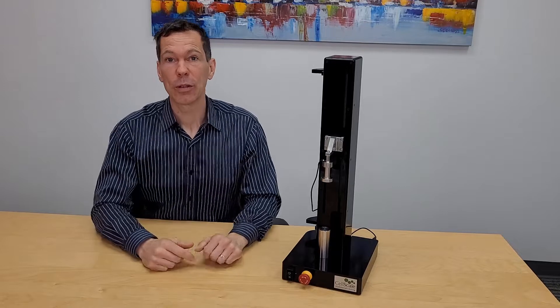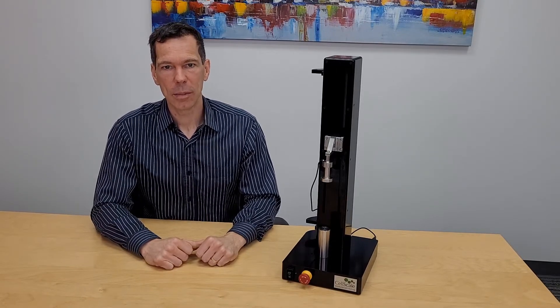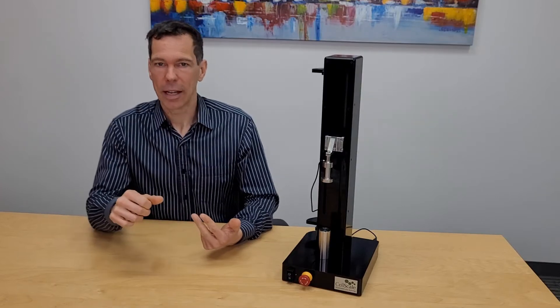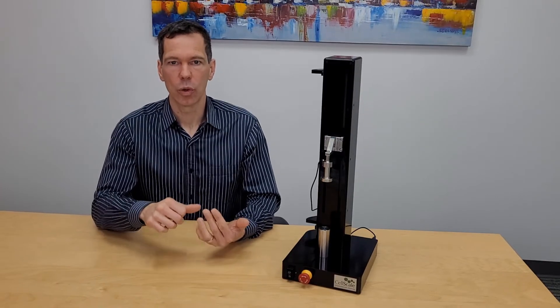It's a 300 millimeter stroke, 200 Newton force capacity system. It can do tension, compression, bending. It can even have options for adding shear and torsion capabilities.